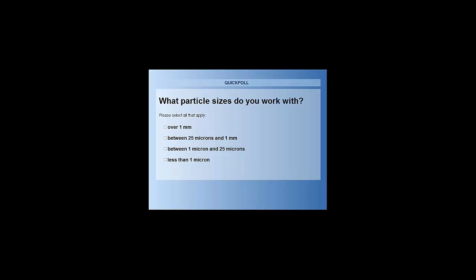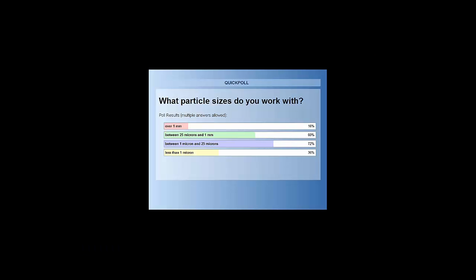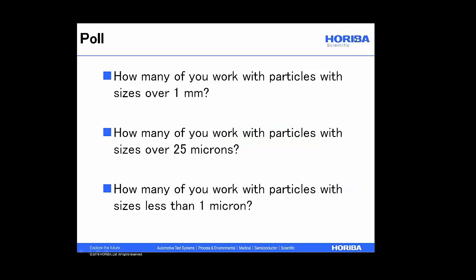Okay, close. And the bulk of the audience, call it the modal value, has between 1 micron and 25 microns as their particle size range. So you're certainly in the right talk because this is the right instrument. And we'll talk a bit about how that case is handled.